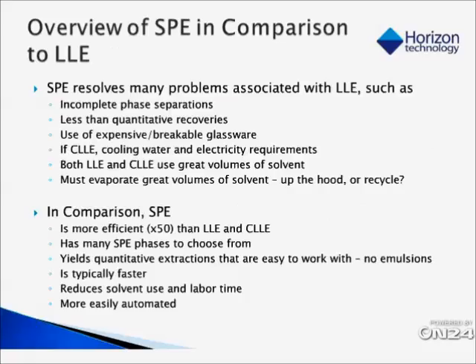Now, Jason did a nice job of explaining how SPE works, so I'm just going to talk a little bit about the comparison with liquid-liquid extraction, which is the conventional technique which has been often used for extraction of samples in many markets. By comparison, solid phase extraction can be up to 50 times more efficient than liquid-liquid extraction and continuous liquid-liquid extraction. There are many SPE phases to choose from.